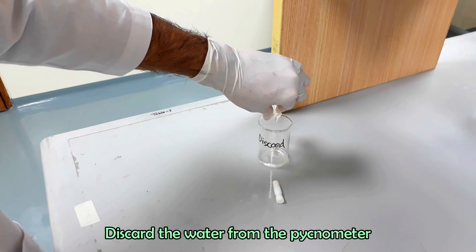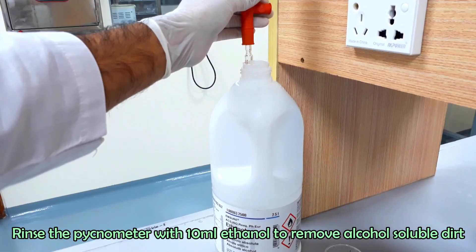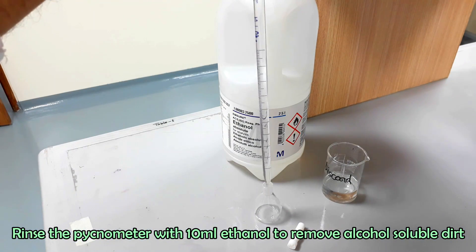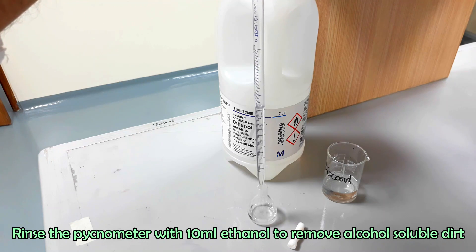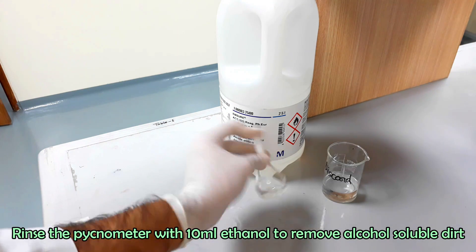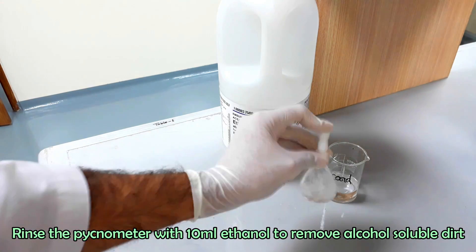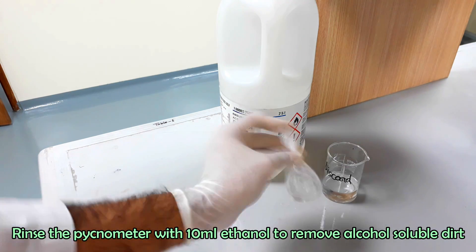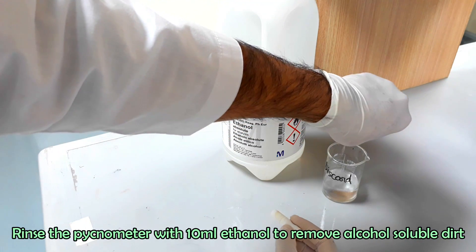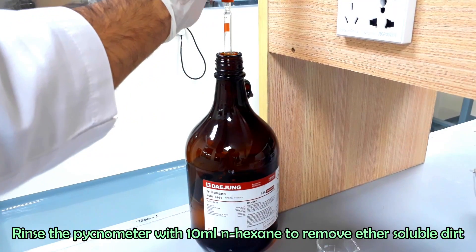Discard the water from the pycnometer. Rinse the pycnometer with denatured ethanol, then rinse the pycnometer with N-hexane.